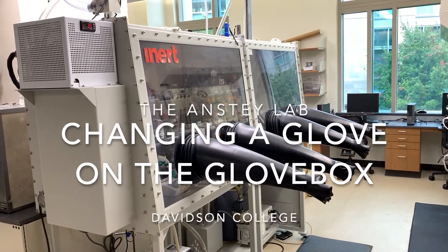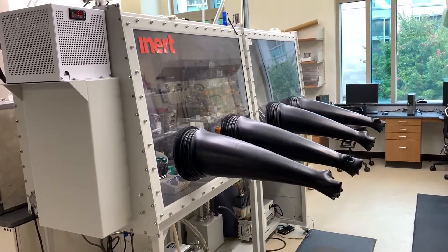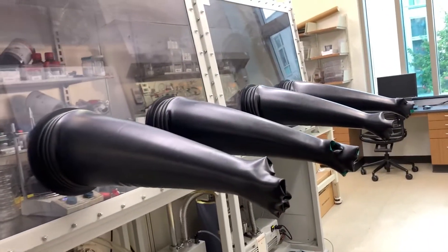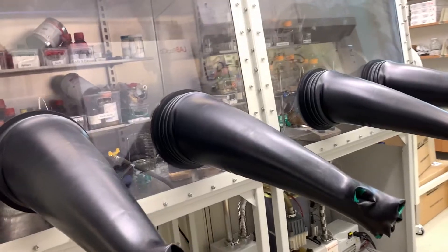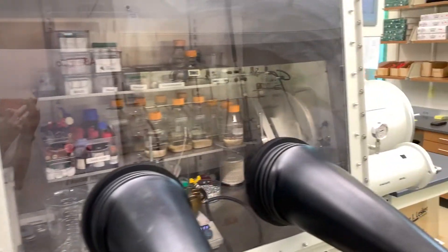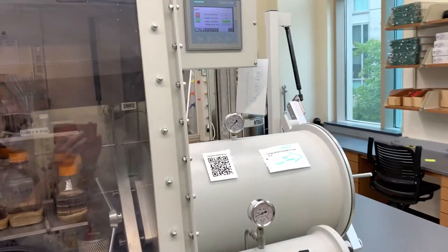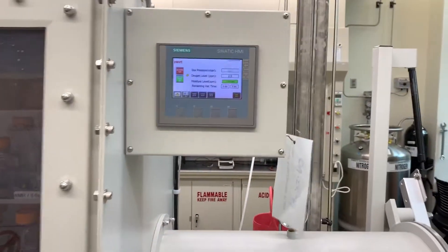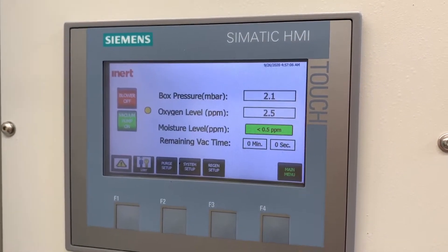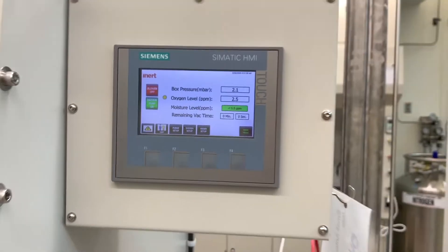In some ways, a glove box is a pretty simple piece of laboratory equipment. As the name suggests, it's a tin can with some gloves and a window. But that would really be too simplistic, because this glove box does more than just providing a place to work. It also must be a place that is devoid of oxygen and humidity. To do that, it must be sealed from the outside, preventing the atmosphere that contains those life-giving chemicals from making their way inside and ruining everything.